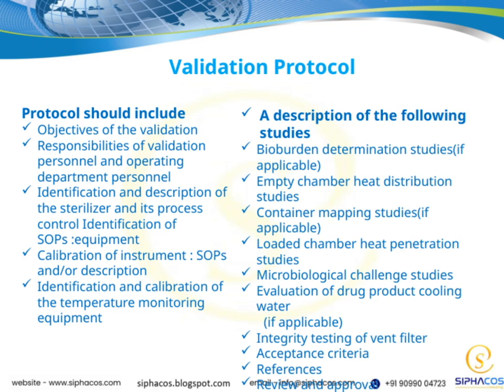Loaded chamber heat penetration studies are also crucial because they demonstrate that the sterilant reaches all parts of the load effectively. Microbiological challenge studies are designed to evaluate the sterilizer's ability to inactivate resistant microorganisms, confirming the sterilization process's efficacy. We also need to evaluate the cooling water used for the drug product, if applicable, to prevent contamination or process interference. Additionally, integrity testing of vent filters is performed to ensure they maintain their integrity throughout the process, preventing microbial ingress. Of course, all these studies must meet specific acceptance criteria, which serve as benchmarks to confirm the process is consistent and reliable.